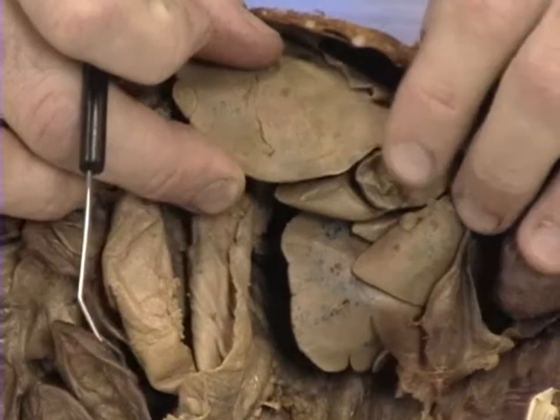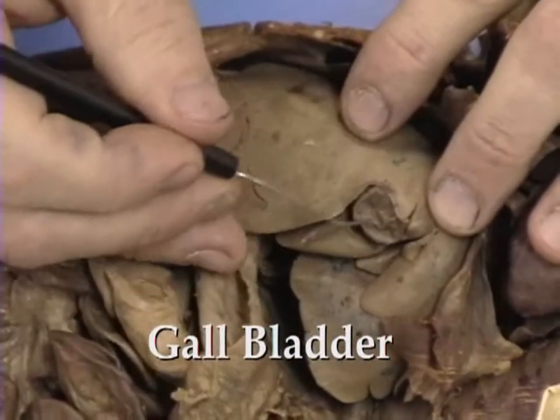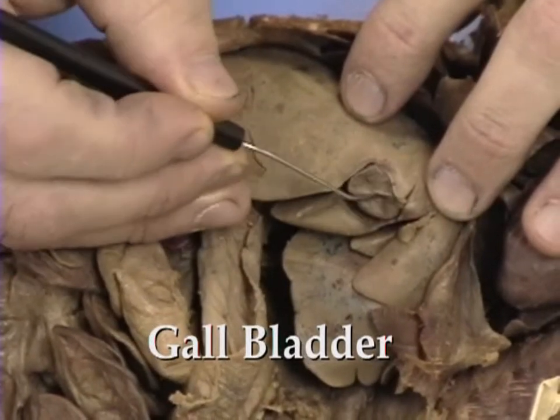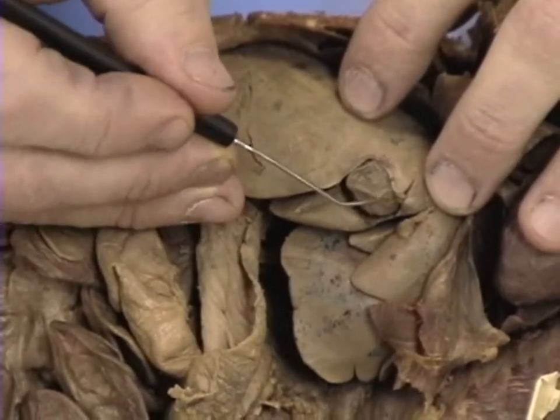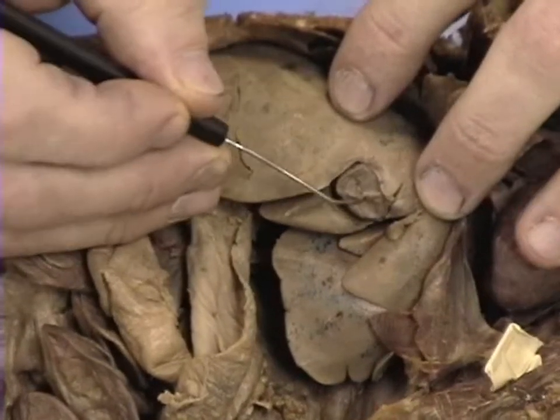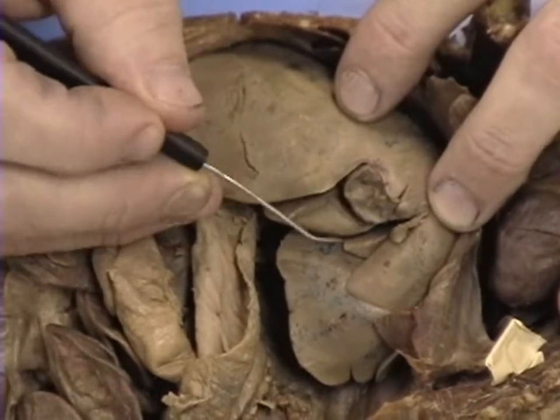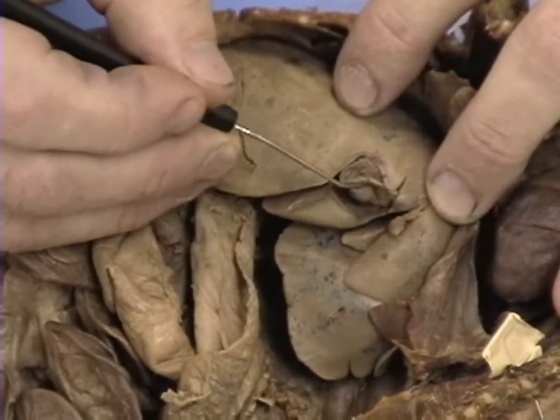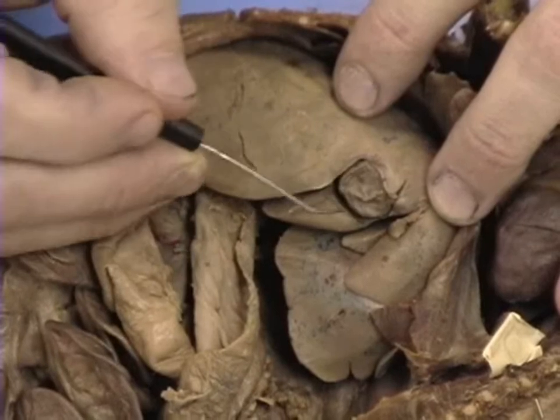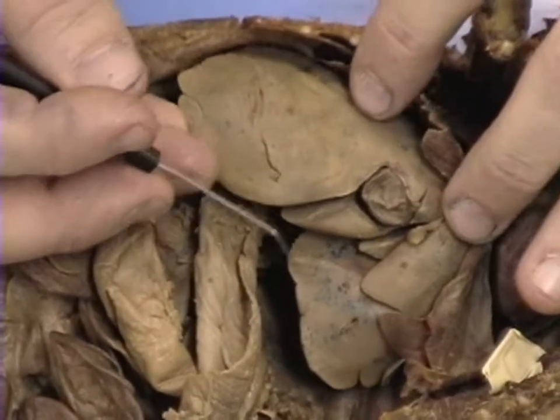While we're here on the liver, we might as well take a quick look at the gallbladder. The gallbladder is located right here, has a little bit different characteristic than the rest of the tissue of the liver because it is primarily a sac. We know the gallbladder carries and stores the bile produced by the liver. Sometimes the gallbladder on the cat will be a little bit of a greenish color.